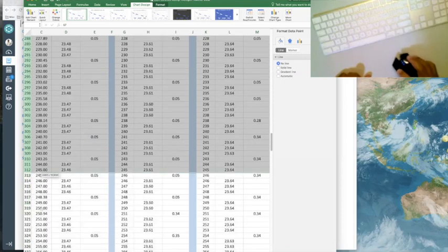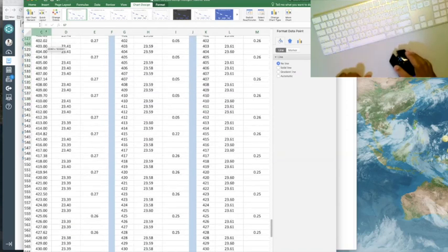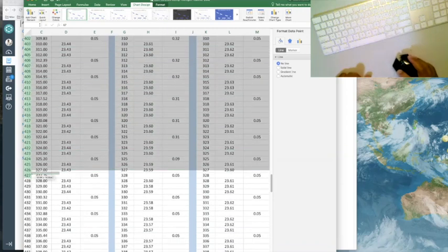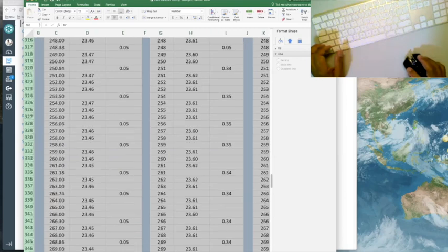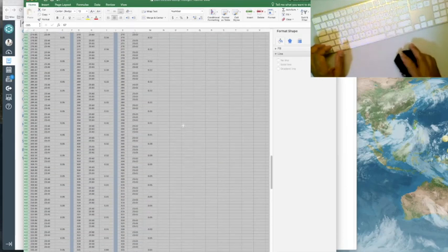and then probably stop right about, let's see. You've got to be careful because sometimes when you do this, you tend to overextend yourself. Okay, right here to about 340. And then I'm going to go ahead and delete this. I want to show you what happens to the graph when I do that.